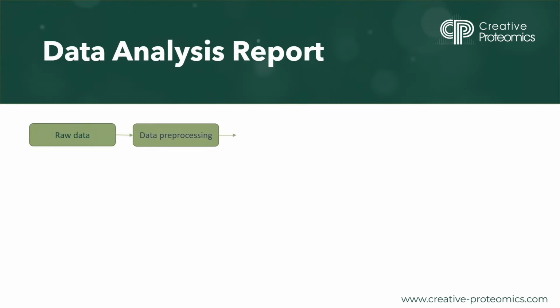Next, we move on to data pre-processing. This crucial step ensures data quality and integrity. We correct baselines, detect peaks, filter noise, and align retention times across samples. By doing so, we remove any variations or artifacts that could affect the accuracy of our analysis.